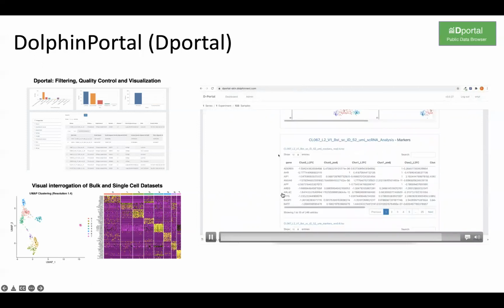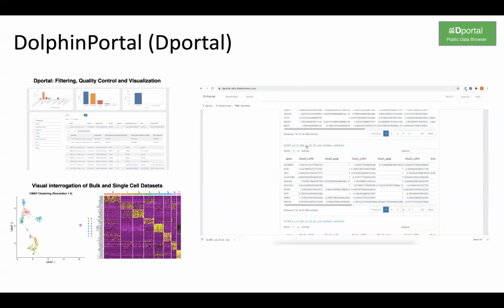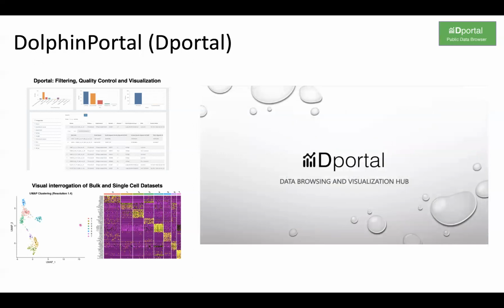And we already have these pipelines, but I'm sure when you start working on this, you're going to see that you need to change them. So we allow that; we give them as a template in DNext, and you change them when you press the run button, and they're going to be in your portal, shared with your collaborators or yourself for your own records.